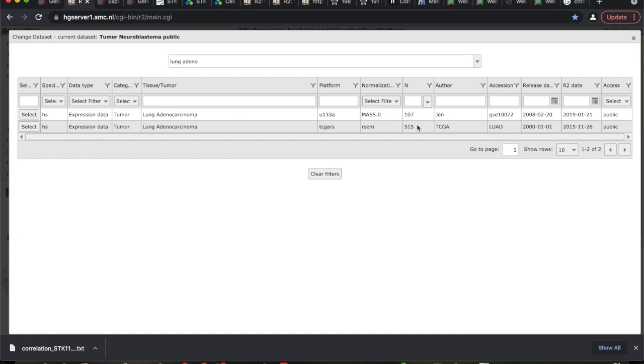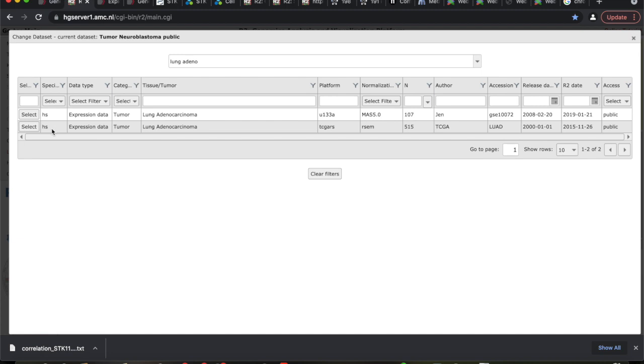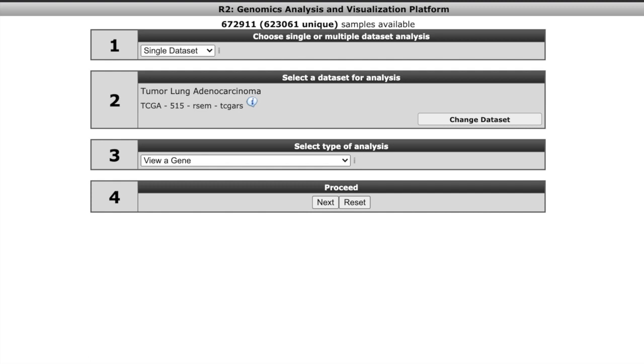This happens all the time. You go into a database, come out and then you're back to mining the stuff that you just came from. So here's what I want to do is I want to select the TCGA-ARS platform. Up here, it should say tumor lung adenocarcinoma and should say TCGA-515. Does everybody got that?